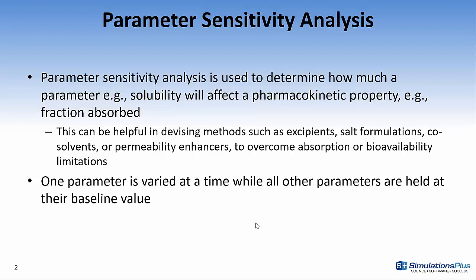With parameter sensitivity analysis, one parameter is varied at a time, while all other parameters are held at their baseline value.